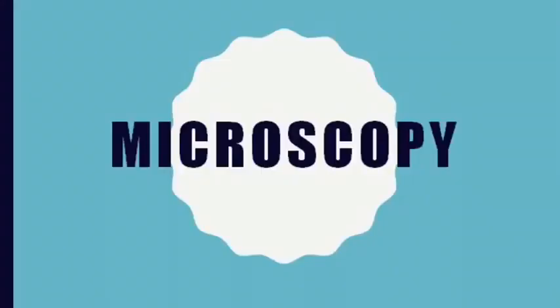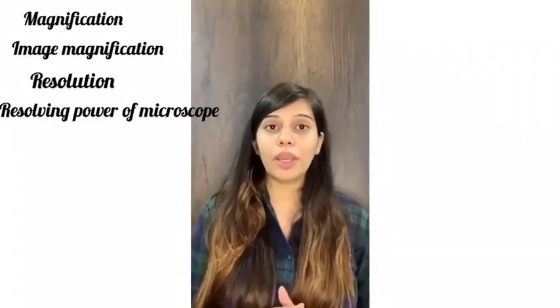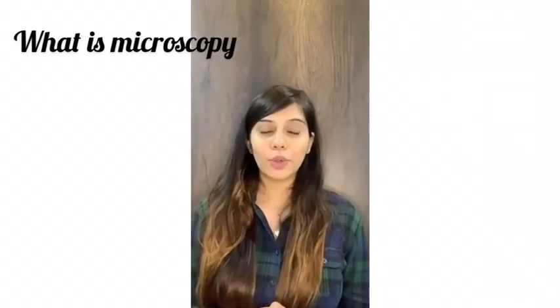In this video series, we are going to discuss the microscope. First of all, we'll discuss the terms related to microscopy, like magnification, how an image gets magnified, resolution, the resolving power of the microscope, and the limit of resolution. So let's get started. What is microscopy? Microscopy is a science for investigating small objects using a microscope.